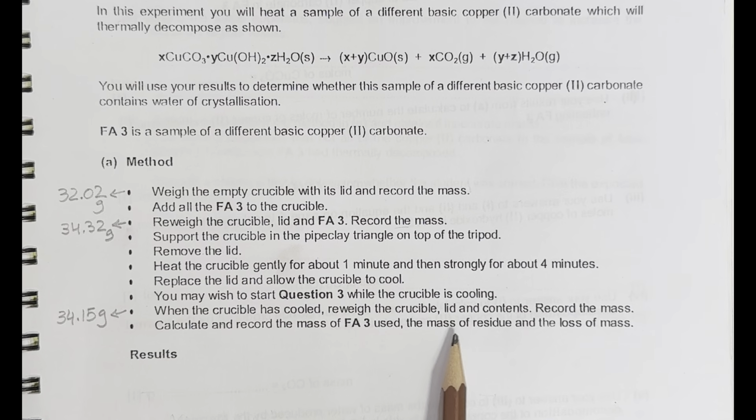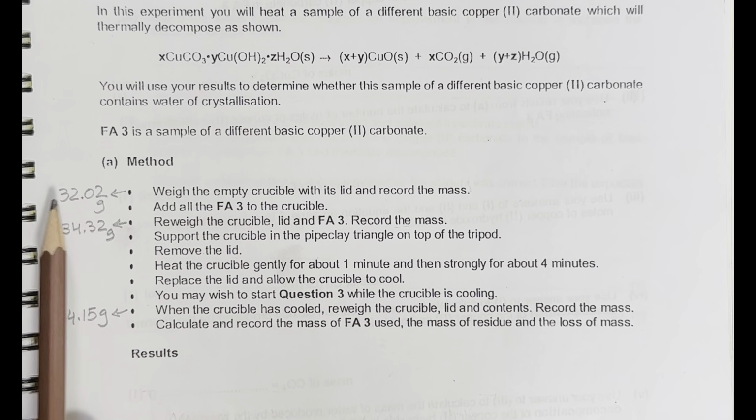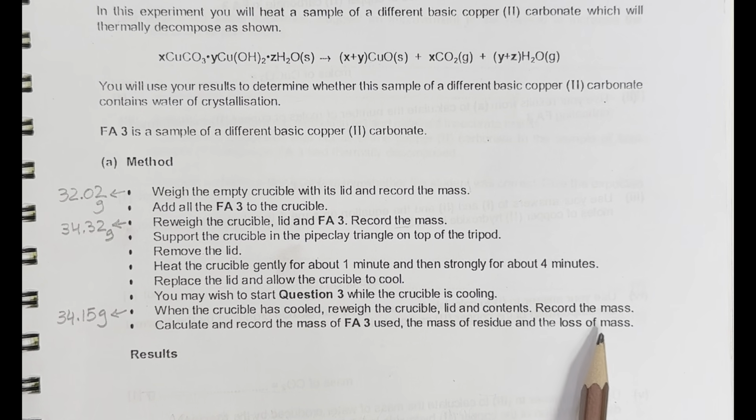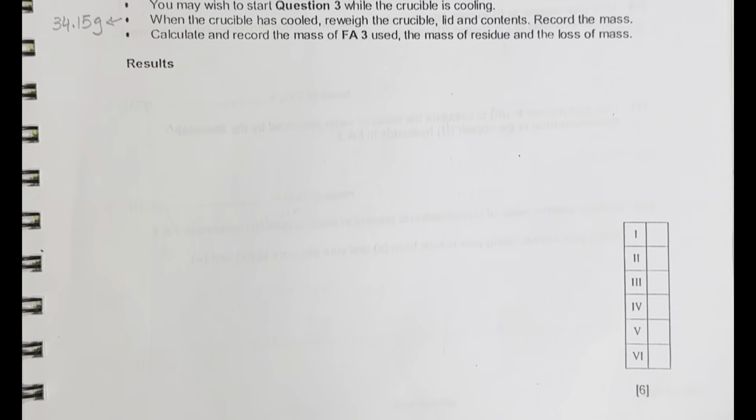Then the mass of residue, and the mass of residue can be calculated by subtracting this value with the only crucible and the lid mass. Then the loss of mass. So the two calculated values, FA3 used and the residue remaining, when we subtract these two, we will get the loss in mass. So let's record all the observations and readings in this space provided.